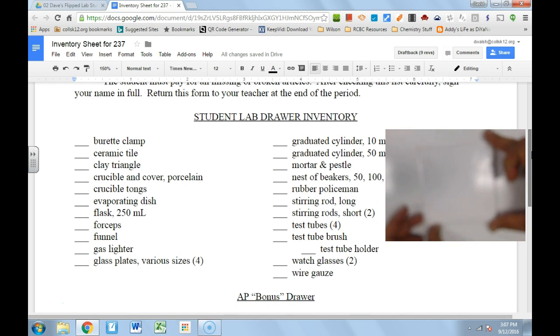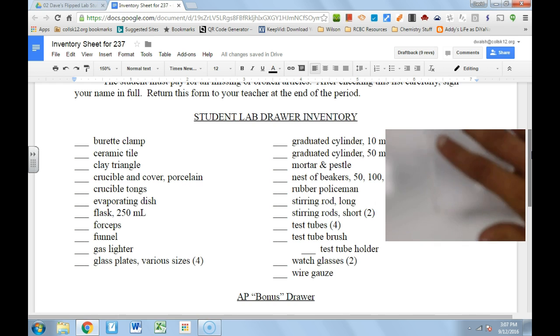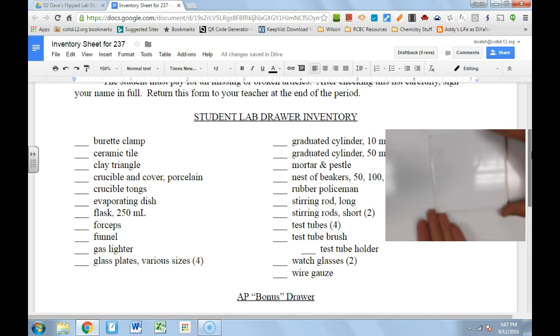Next up we have this wonderful ceramic tile — a beautiful ceramic tile. It's nice and square and you can rest hot things on it. So if I had a hot material, it would sit on this pretty much like a coaster in your house.